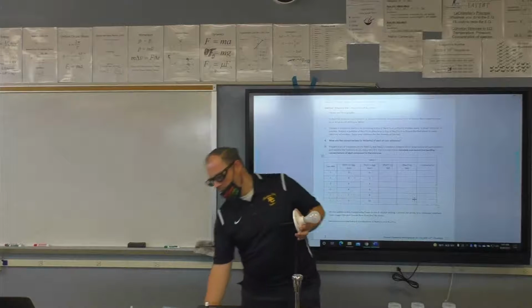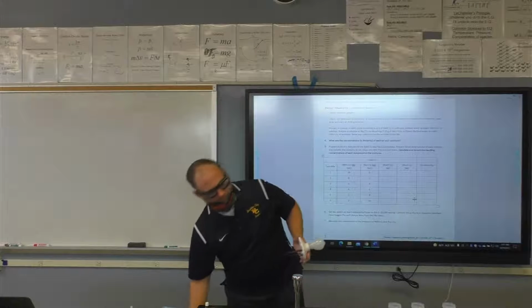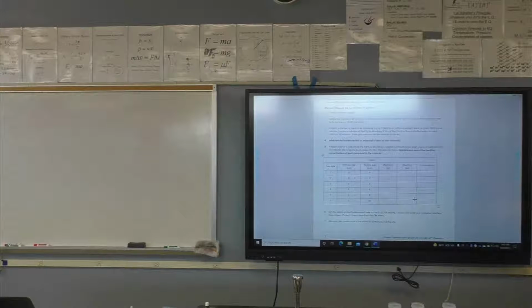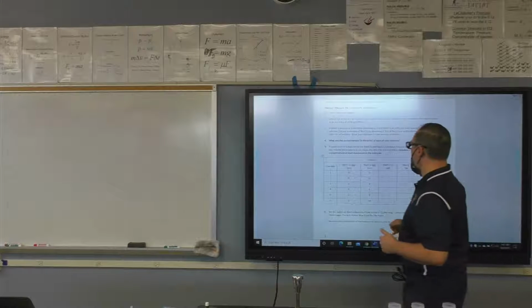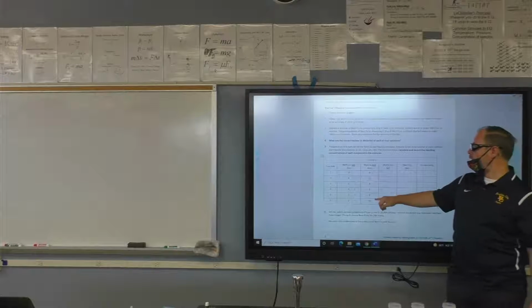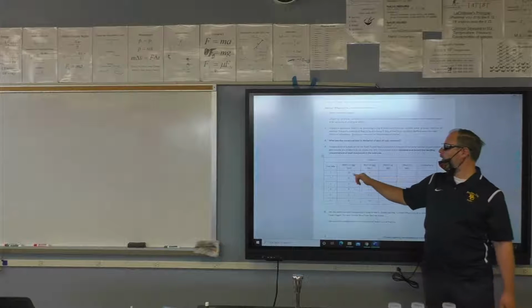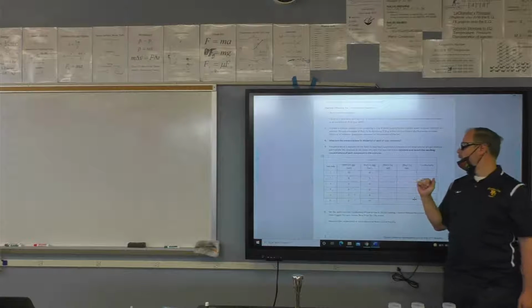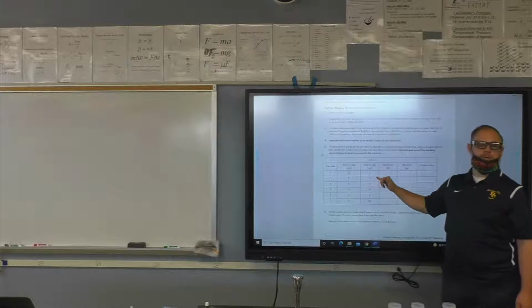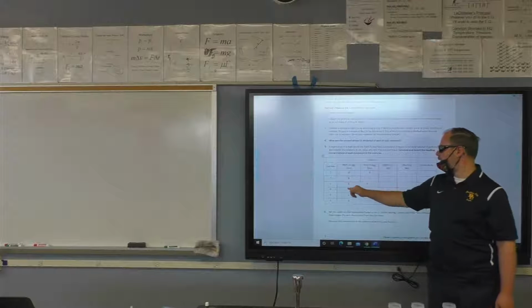So that's what you're going to do. You're going to make a solution of a mixture. You're going to make a solution spectrum. So in your lab, you're going to say, all right, I'm going to make 6 solutions. 1 and 6 are already done for you, really. So for number 1, it's going to be all sodium bicarbonate. Number 2 is going to be 8 milliliters of sodium bicarbonate and 2 milliliters of sodium carbonate. And then 3 is going to be 6 and 4, and then 4 and 6.